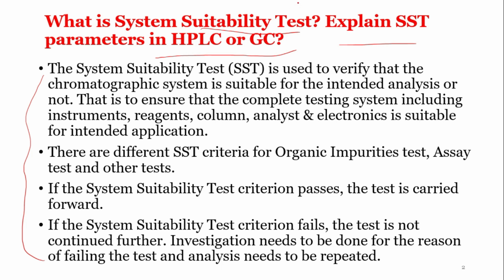So what is system suitability test? We can understand it as the test of suitability for the system, that is, the test of suitability of the system, you can say like this. So what is system? Now you will understand in a very easy way the test of suitability for the system. Explain SST parameters in HPLC or GC. So why is SST done? So we will see in this.